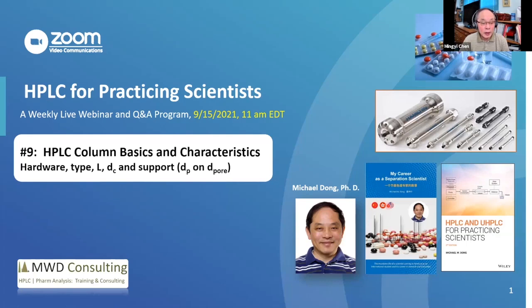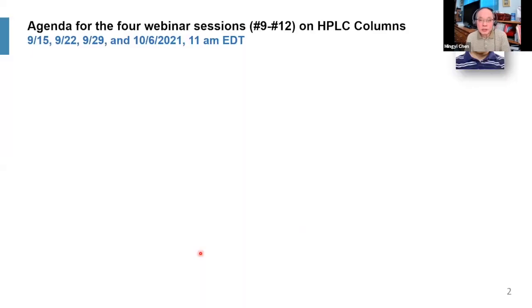Okay, so we're going to talk about HPLC column basics and also characteristics. Today we talk about hardware, different types of columns, column length, column ID or inner diameter, and some of the support type, meaning the particle size and the pore size. This is a series of 4 webinars on HPLC columns, starting this week and running for 4 consecutive weeks.